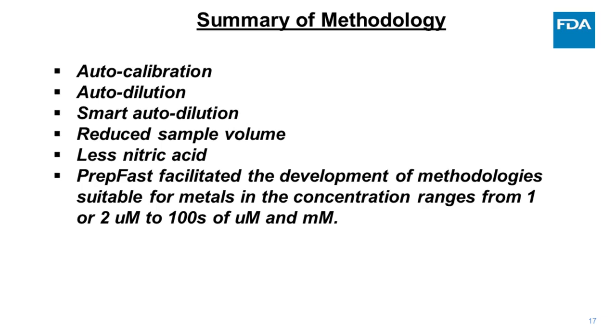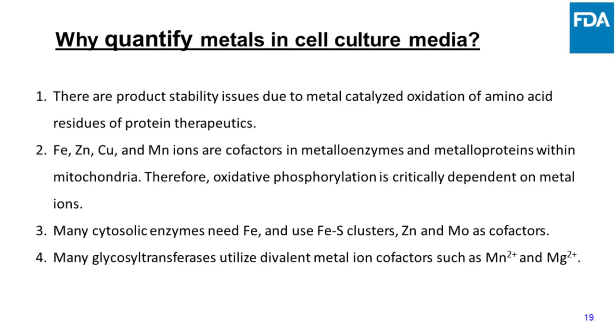Yes. Thank you, Adil, and thank you, Robert. Thus far, we have heard the merits of the ICP-MS for determining the metal content and concentration in cell culture media. Although you have already heard from the previous speaker on the importance of metals in cell culture, I would like to emphasize the need for quantification of metals in cell culture media.